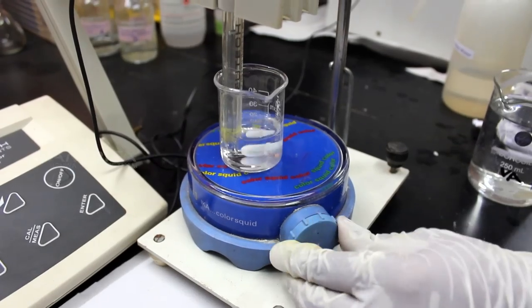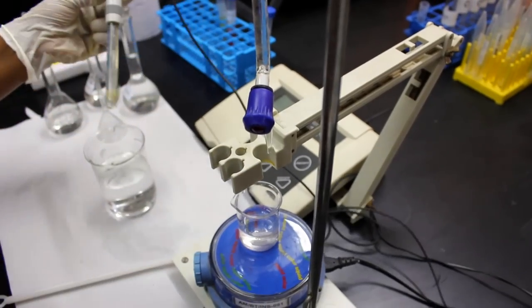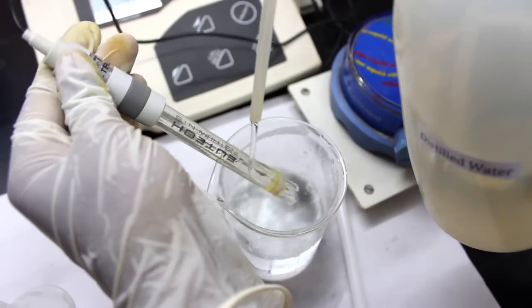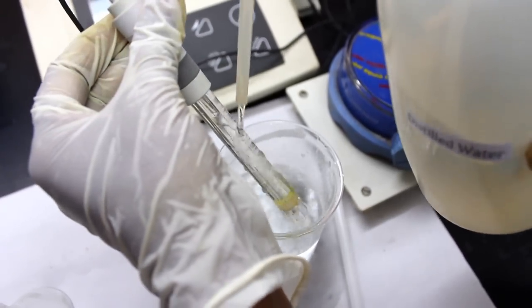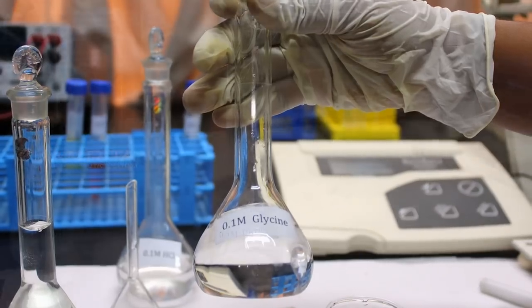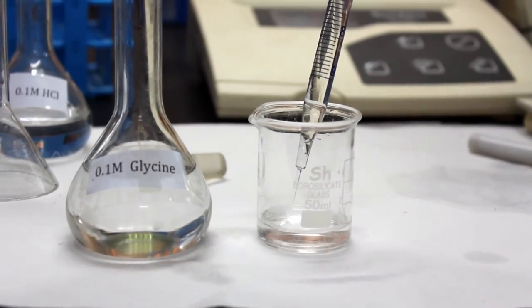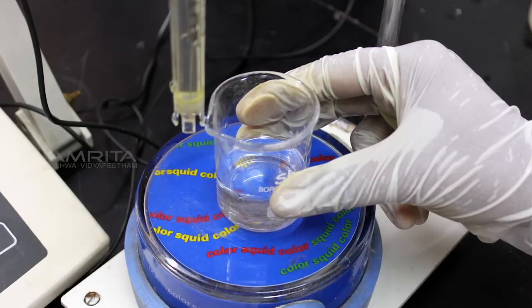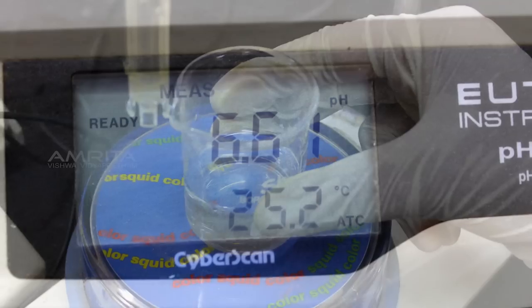Now stop the stirring and remove the electrode from the stand. It should be washed thoroughly with distilled water. Again transfer 20 ml of 0.1 molar glycine into a fresh 50 ml beaker and place it on top of the stirrer and record the pH.